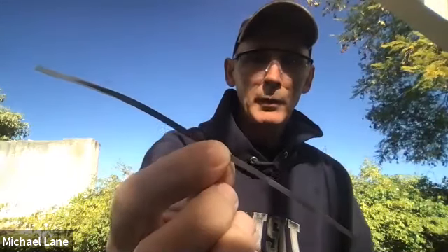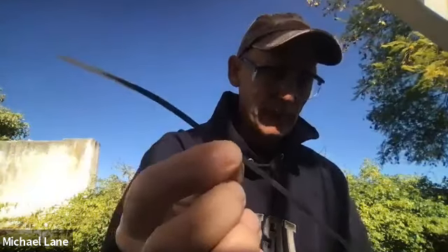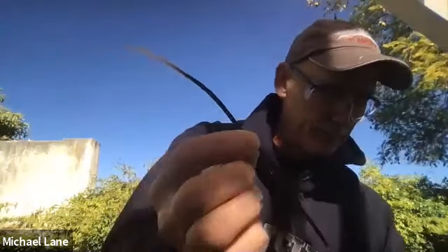Now, in a moment, I am going to ignite this. Note that this piece of magnesium I weighed out and is approximately 1.00 grams of magnesium. We'll use that in a minute. It is the case that magnesium metal is actually a flammable metal. It's a little bit unusual, as many metals simply will not ignite. So I'm holding it here with a pair of wire cutters. I've got an assistant here that's going to help me light this.